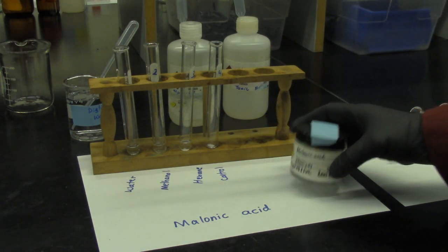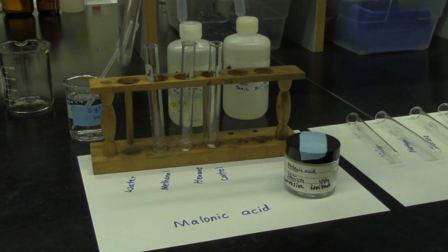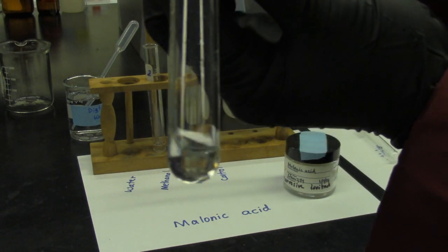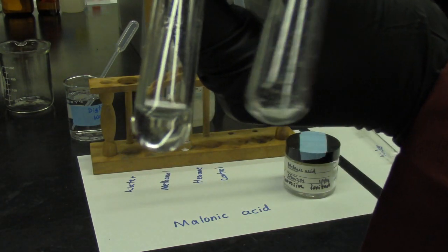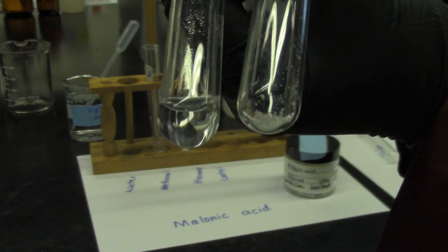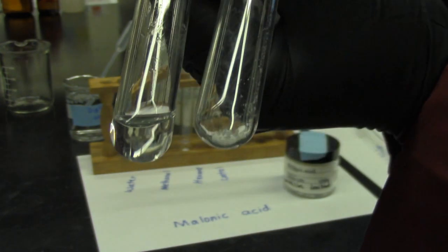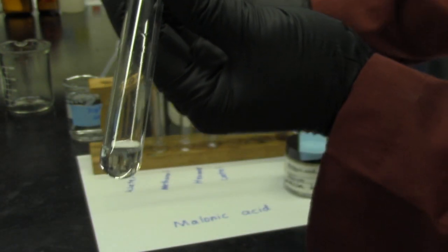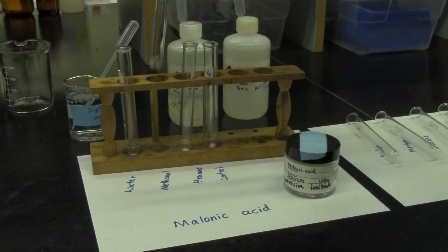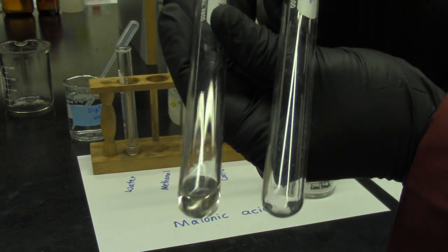Moving on to malonic acid. First test tube, malonic acid plus water. Clear solution. Write down the observation and compare with number 4, the control, malonic acid. Then you can see the bottom of the test tube. Test tube number 2, malonic acid plus methanol, and stir for 1 minute.